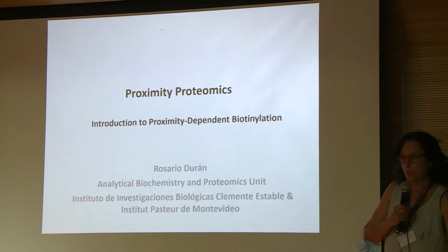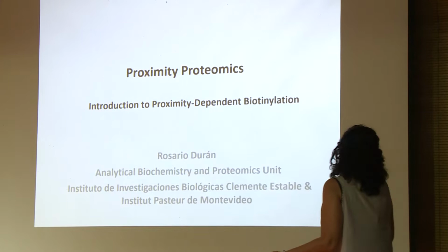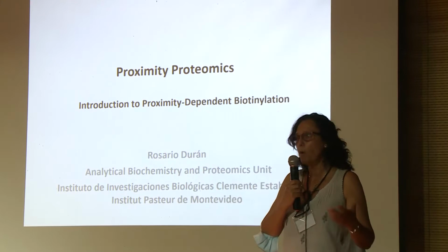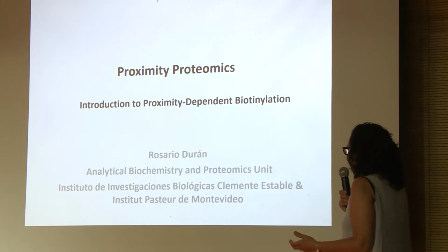Okay, so the idea of this presentation is to give you an introduction to proximity proteomics, and this kind of methodologies called in general proximity proteomics, but in particular I'm going to talk about proximity-dependent biotinylation, used to map or to explore the proteomic environment of a protein of our interest, can be many proteins of our interest, and to identify all the proteins that are around. So, I will use it from here.